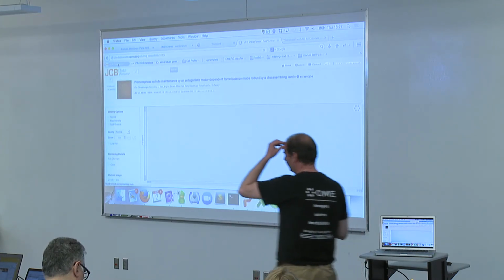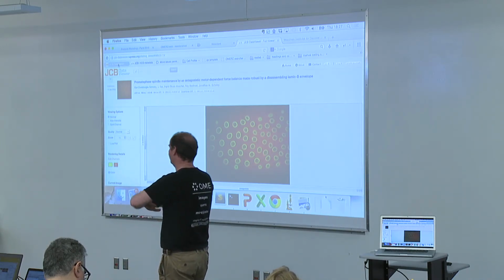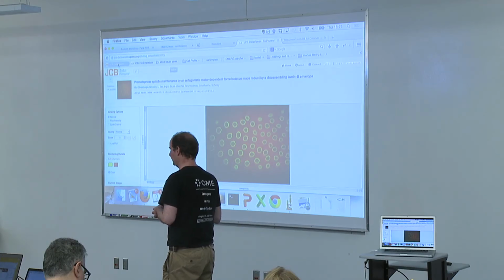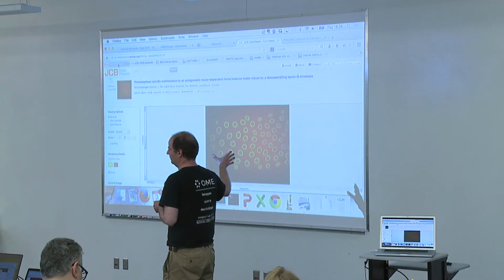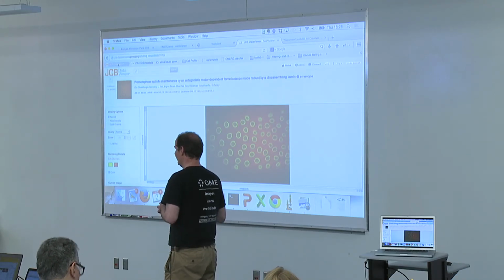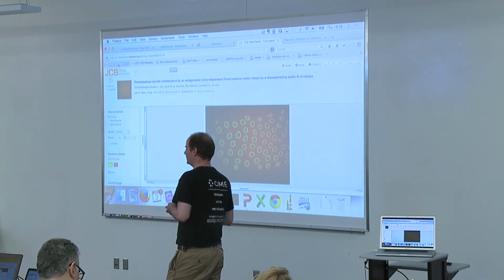There are also other institutes, like the Stowers Institute, who use OMERO for storing the data they are publishing. We also have a new project called the IDR project, where we're aiming to create a big data repository out of OMERO. OMERO is designed to deal with both the amount of images and their size. I was also mentioning the 64,000 pixel image for digital pathology. This is also used in a teaching application called Virtual Microscope. This is a fairly big image per se, and you also need the performance, in the sense that many people are clicking around on it at the same time. So it is possible to extend it in this sense.